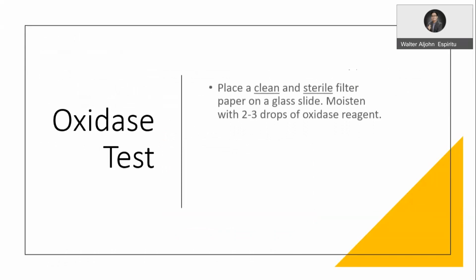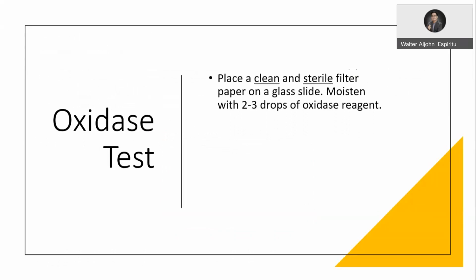Next is the oxidase test. In this particular test, you will assess the presence of oxidase.